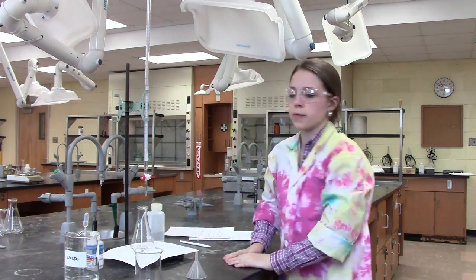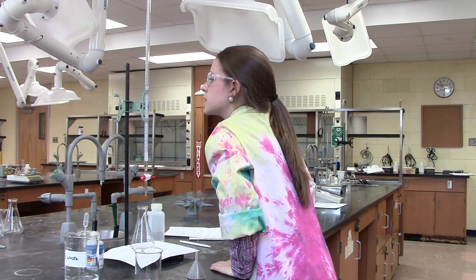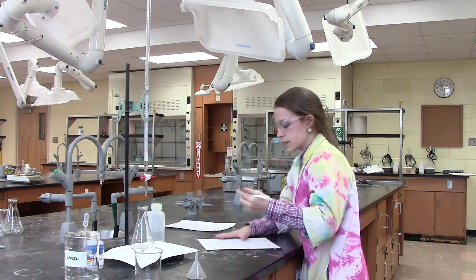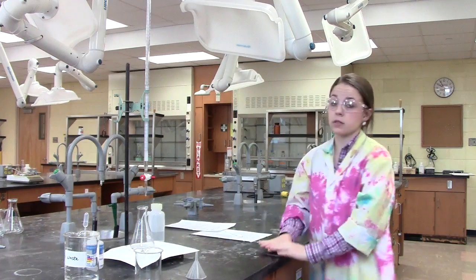Now that our burette is prepared, we're ready to take our initial reading. In this case, our initial reading is 31.50. Note that the readings can be taken to two decimal places. Be sure to record your reading.